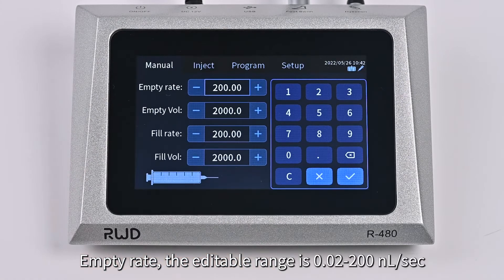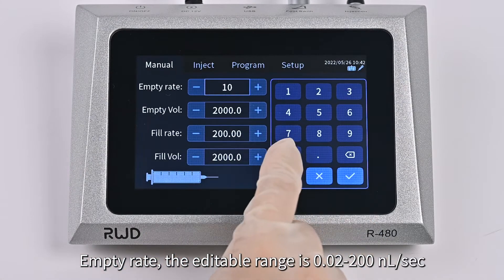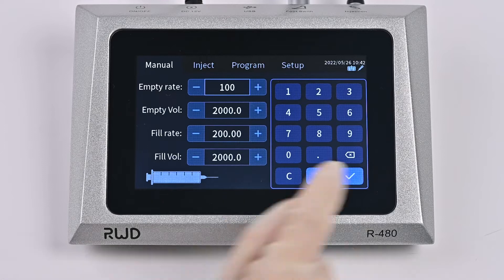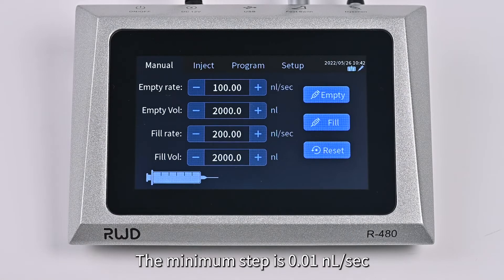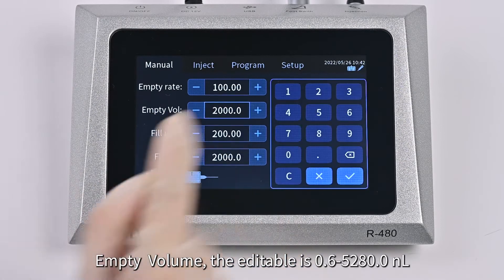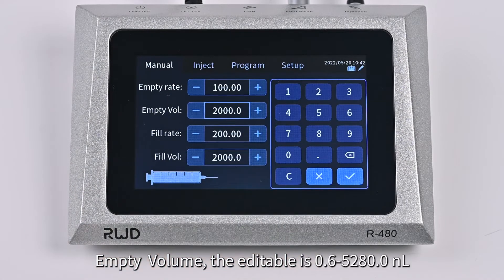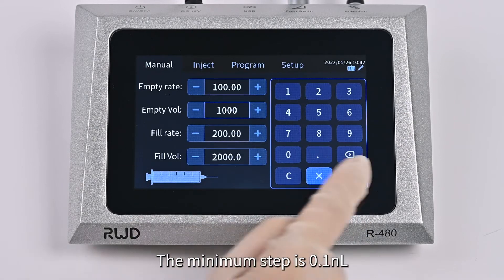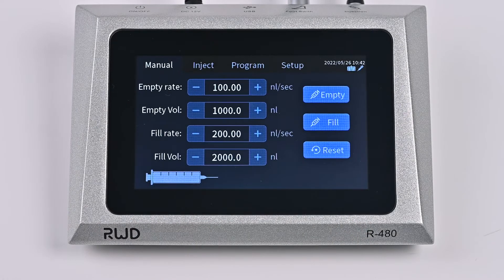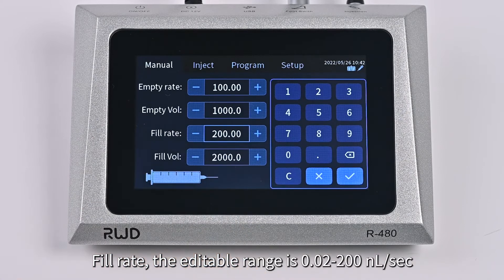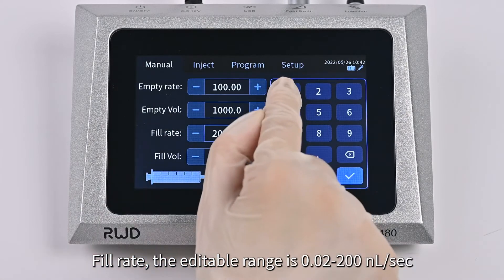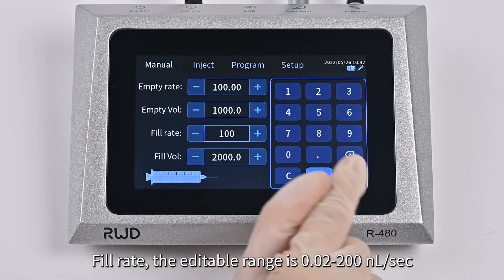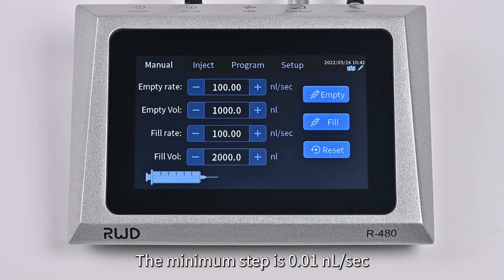Empty Rate: the editable range is from 0.02 to 200 nL per second; the minimum step is 0.01 nL per second. Empty Volume: the editable range is from 0.6 to 5,280 nL; the minimum step is 0.1 nL.